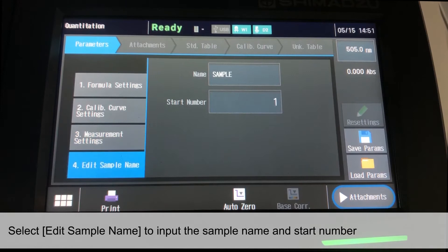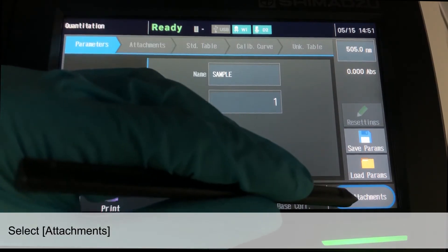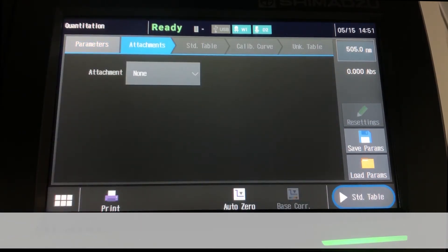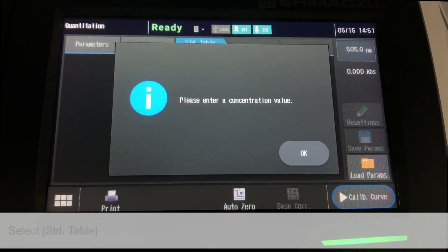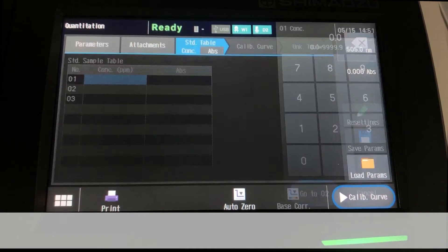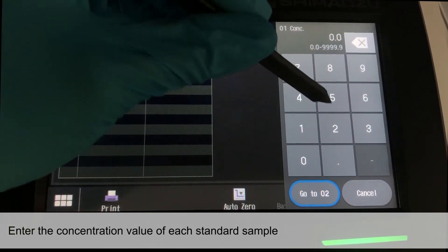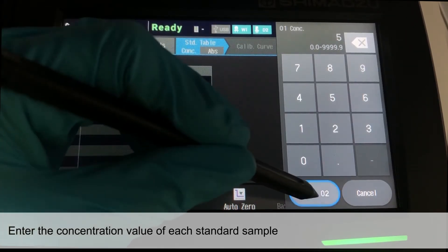Select Edit Sample Name tab to input the sample name and number if required. Now, we will select Attachment. Since we will not be using any attachment, we will proceed to Standard Table. Enter the concentration value of each Standard Sample to be measured.